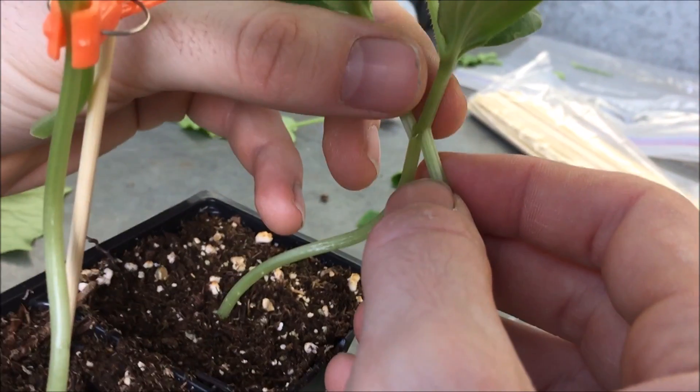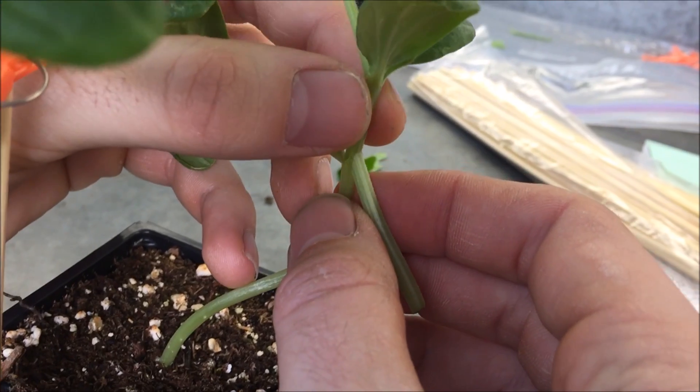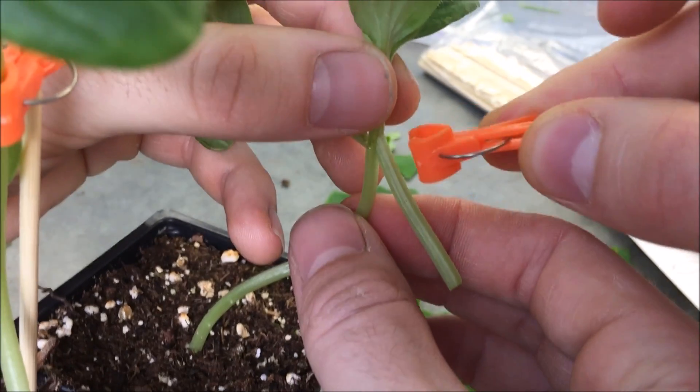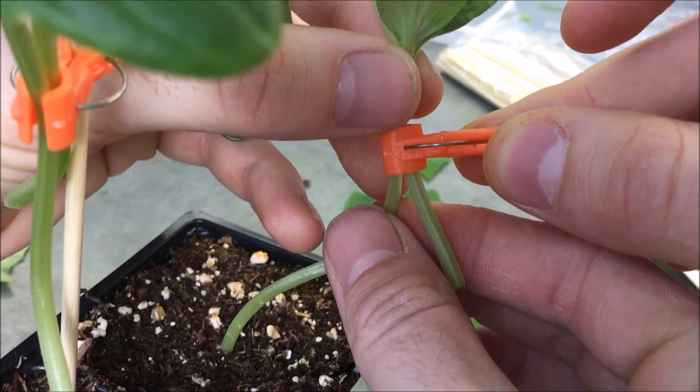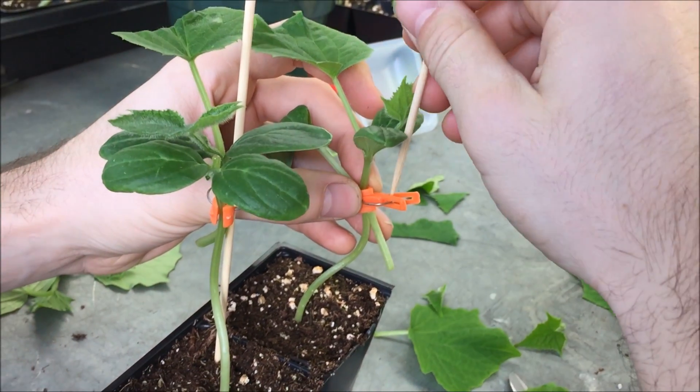Finally, this is the most delicate operation. The scion and rootstock cuts are joined together. The graft is fixed with a grafting clip to favor the cambial contact. Then a wood stick is added to support the graft.